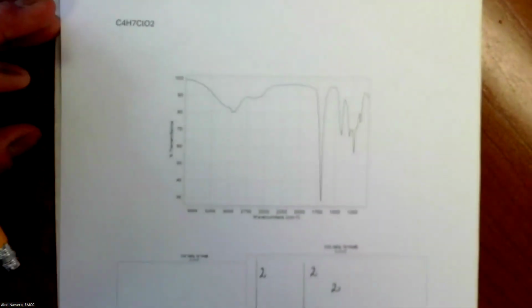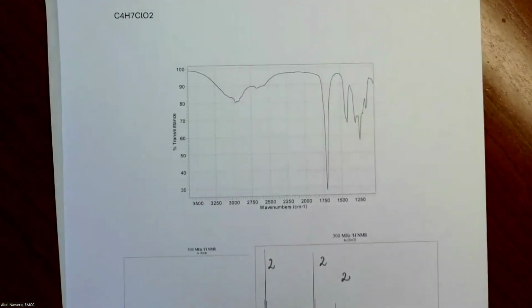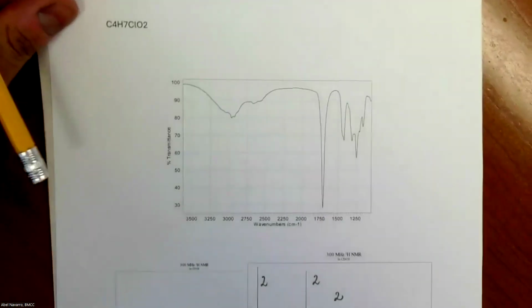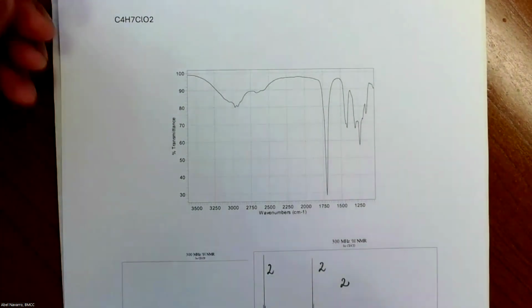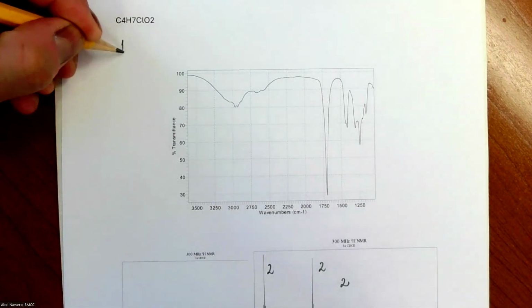Okay, good. Next one. We have a few more. I should have 2 more. Yeah, let's just do it all. So you guys have no excuses to not have enough practice sheets or practice problems for NMR. Okay, so DUs here. Let me think. 10 minus 8, 1 DU.